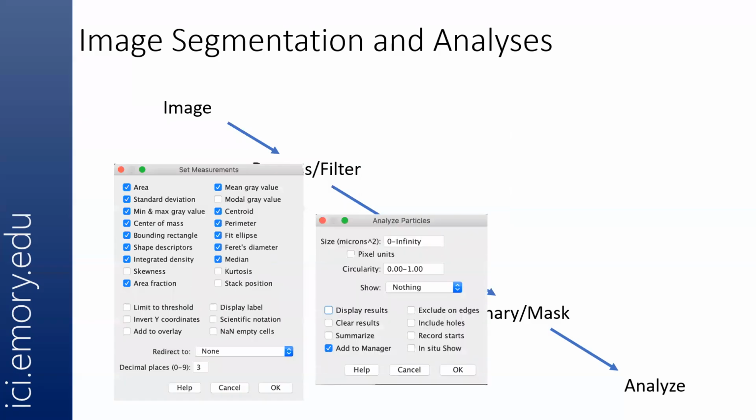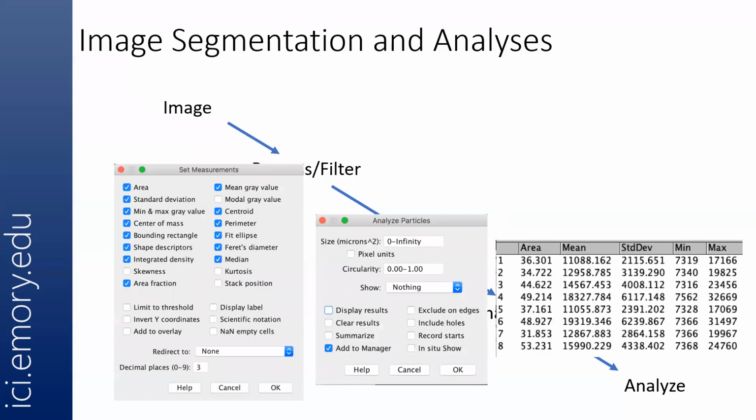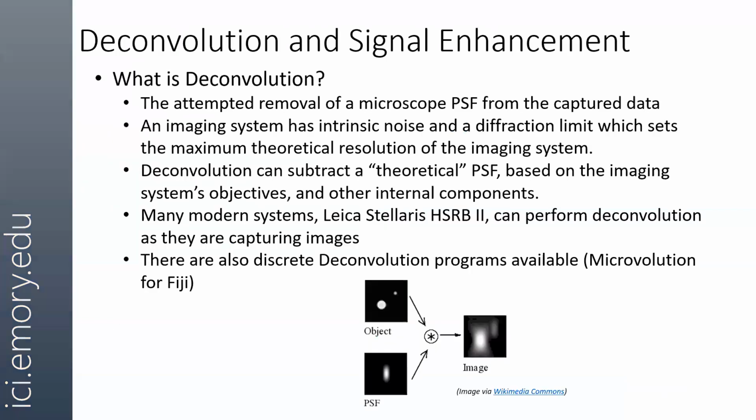We went over analyze particles. We went over that the other day. We can get all sorts of information.